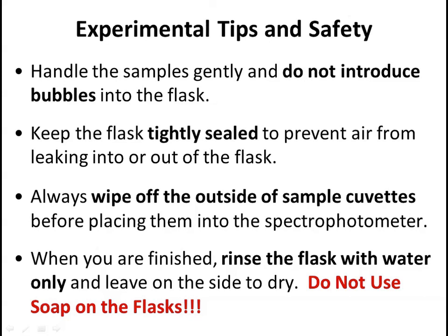Always wipe off the outside of the sample cuvettes before you place them in the spectrophotometer. And when you're finished with the experiment, rinse the flask using water only and leave it on the side to dry. Absolutely do not use soap to clean the flasks, as this can leave a film. The flask should be clean and dry for the students in the later labs to use.